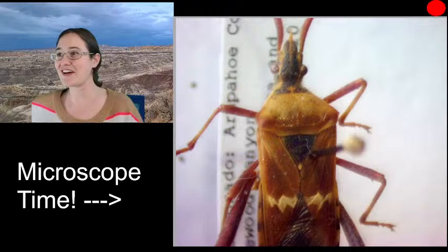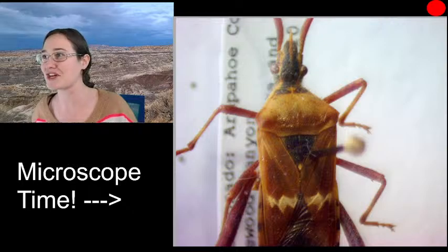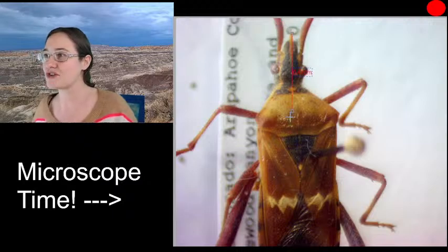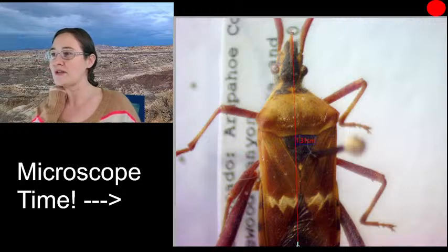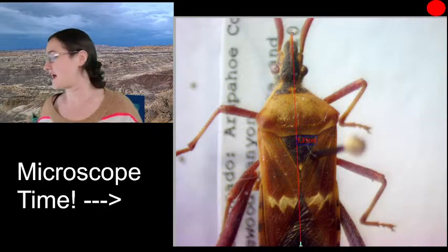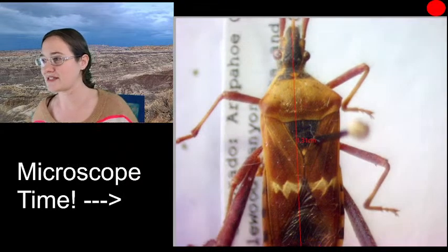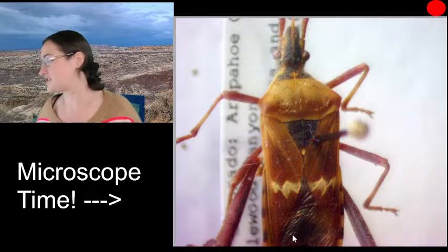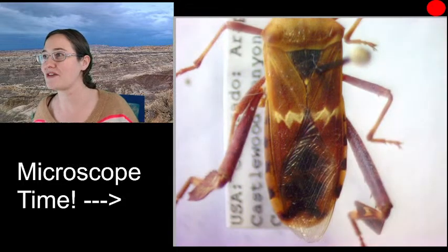Because I did go ahead, I promised some of you guys that I was going to calibrate my microscope so that I could measure. So I did go ahead and do that. Let's see. And so from the head to about here, he is 1.3 centimeters. And then I'm going to scooch him down. We're gonna imagine that that line is there, and we're gonna add the end. I know it's probably not the best way, but it'll get us pretty close.